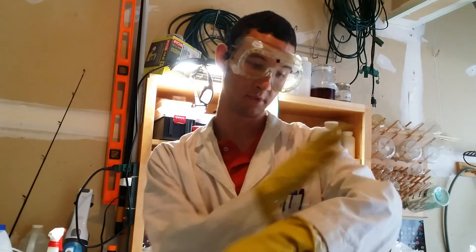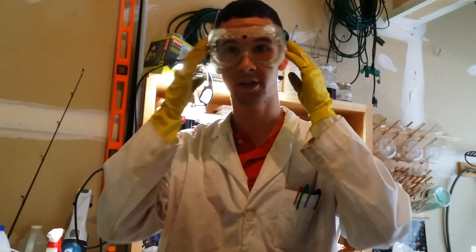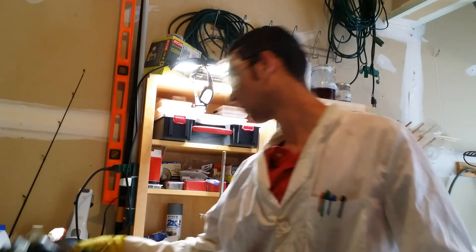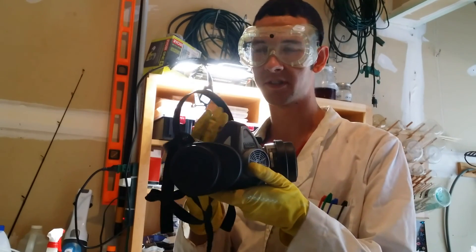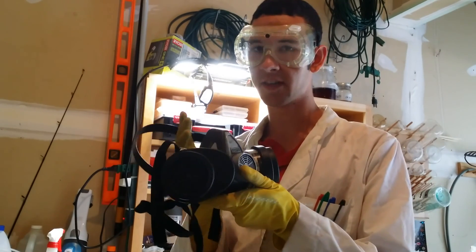The safety equipment you'll need is skin protection, a lab coat, eye protection, and if you don't have a fume hood, a respirator. Bromine is very volatile and the vapors are every bit as deadly as chlorine.